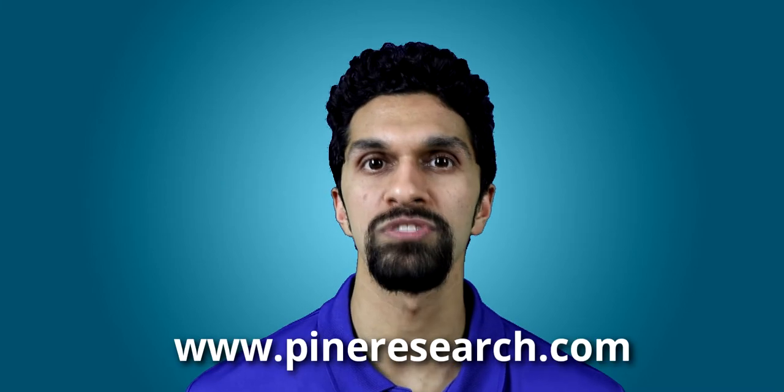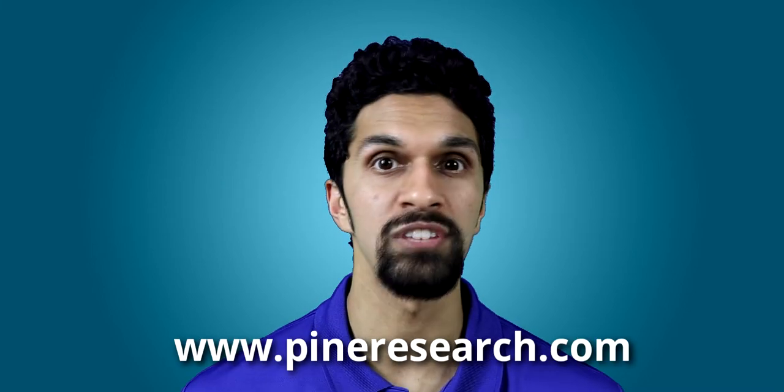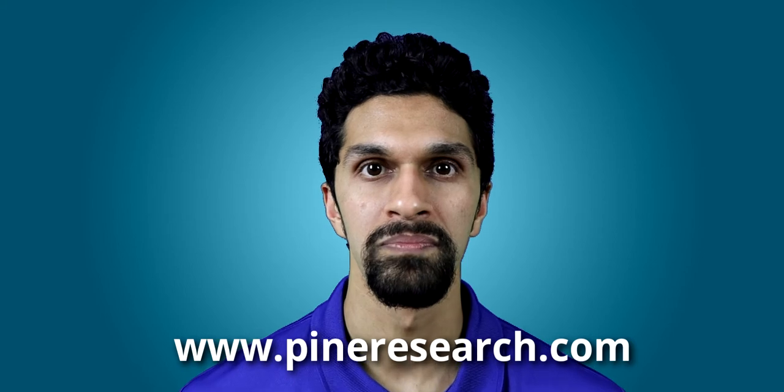This is EIS data that was submitted by you, the researcher, as part of our advanced EIS webinar series led by my colleague, Neil Spinner. If you're interested in future webinars by Pine Research, go to pineresearch.com to stay tuned for more.